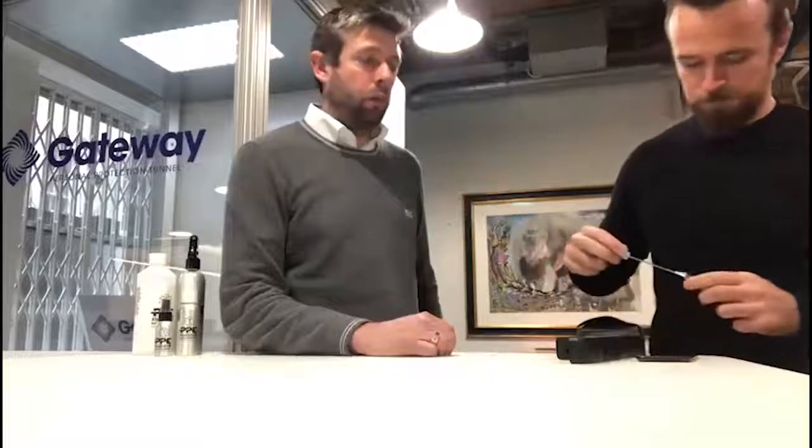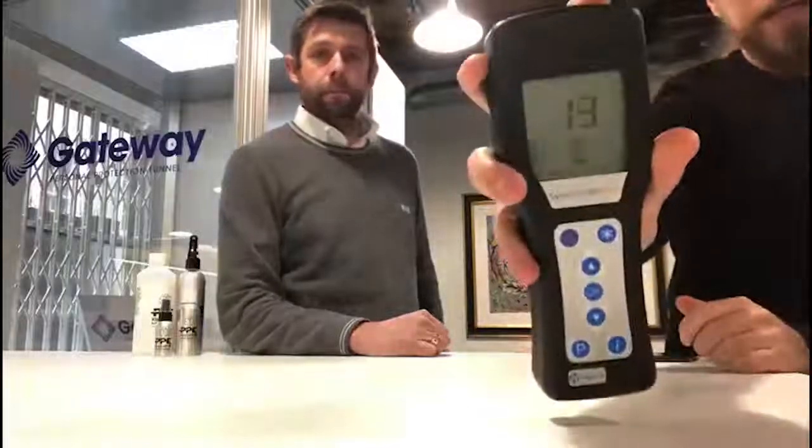It's from the same location as what Chris did before. And we're literally a few minutes since we walked through and did the last test. Okay, so same principle again. Take the sample, put it into the ATP reader, and it's going to do a countdown before it provides us with the readout.